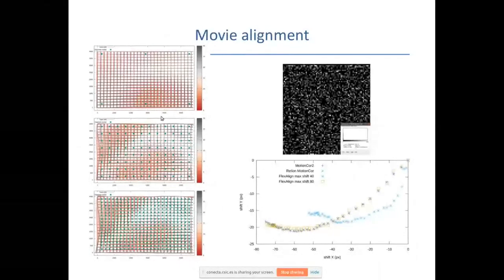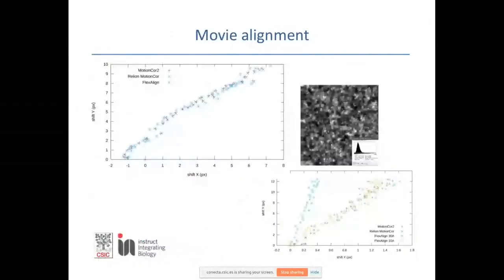With real data, it's very difficult to realize which one is the correct one. We have found a reasonable range for most of the algorithms we use, and I'll show you some results with phantoms later.